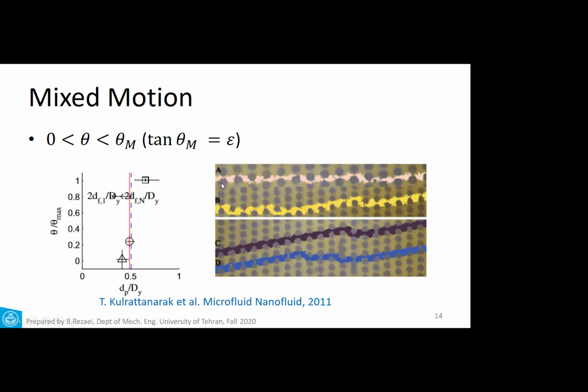As you can see, it goes in a zigzag form, and the particles at the beginning of the path relative to the particles at the end of the path have not been laterally displaced. There is no angle between them. The angle is zero. And as I've already told, there is a bump mode. And if there is a bump mode, we have to see a full separation.